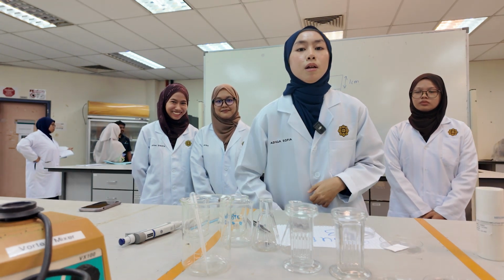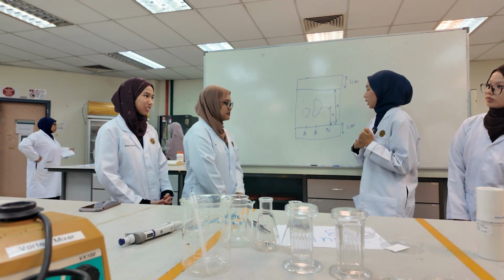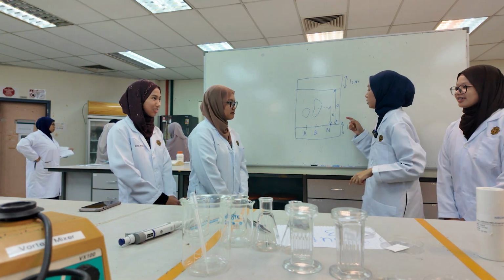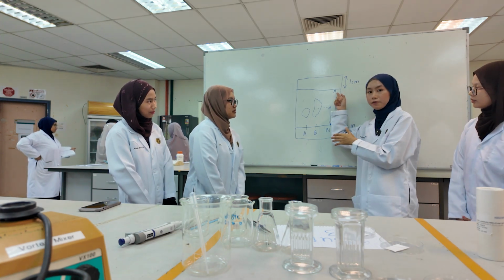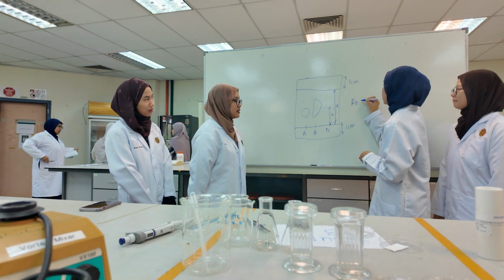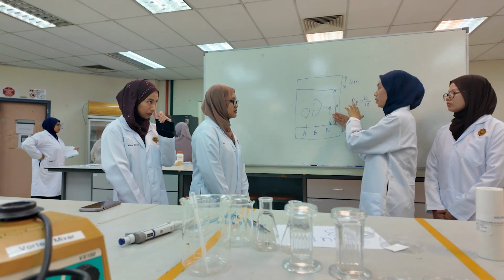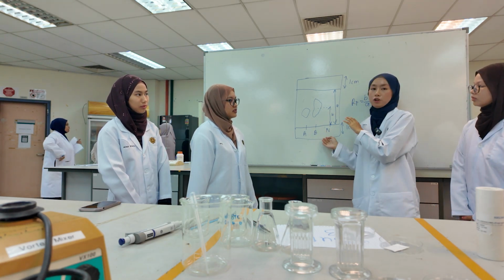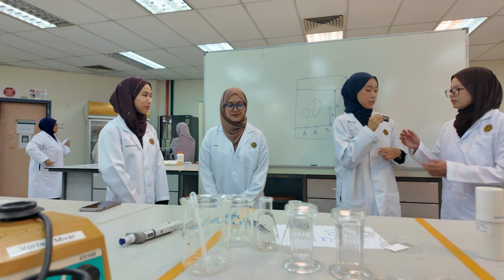Finally, we can calculate our retardation factor. How to calculate it? We measure from the baseline to the center of the spot. This is B. Then measure also from the baseline to the solvent front. This is A. Using the formula RF equals B over A, we compute the value of RF for each compound. So I think that's all from me. Now I will pass to the next presenter.